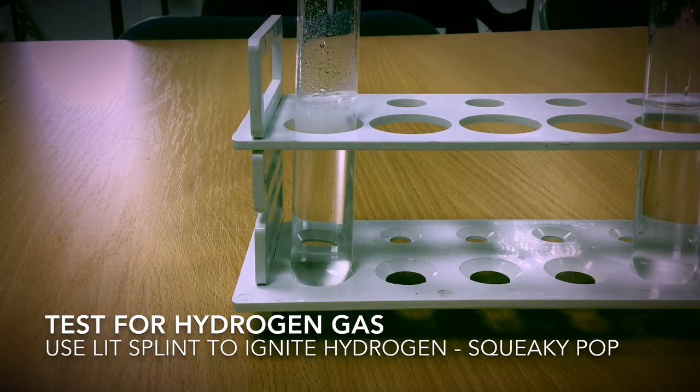What I'm going to do now is take a lighted splint and try and light this gas. You should hear a squeaky pop. Listen up. And there was our squeaky pop.